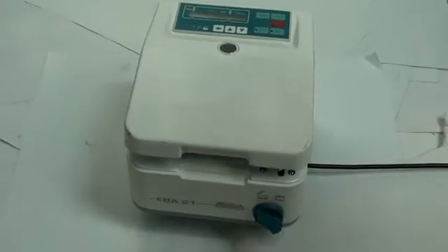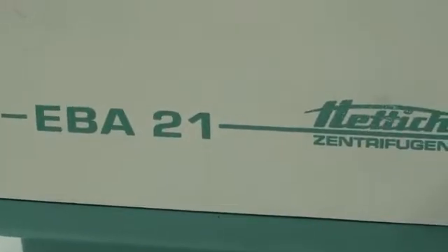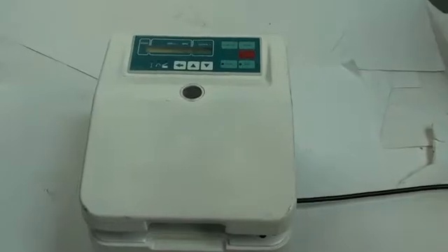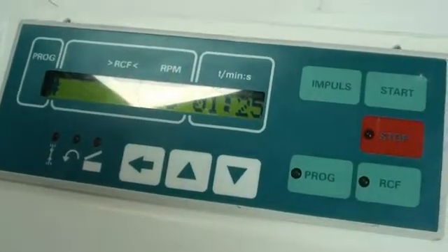Hello again and welcome back to MyCyberOffice ID. Here today we have a Hattich Centrifuge, model number EBA21. This machine runs at 110 to 127 volts and 50 to 60 hertz. The power turns on right there and here's all your controls. This machine is in great working condition and now I'll give you a quick demonstration of how it runs.